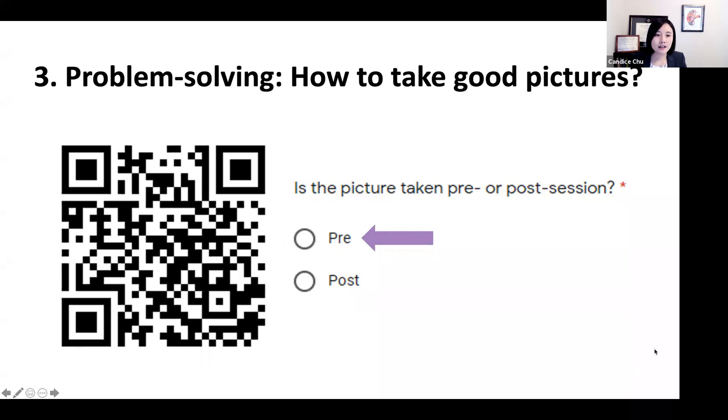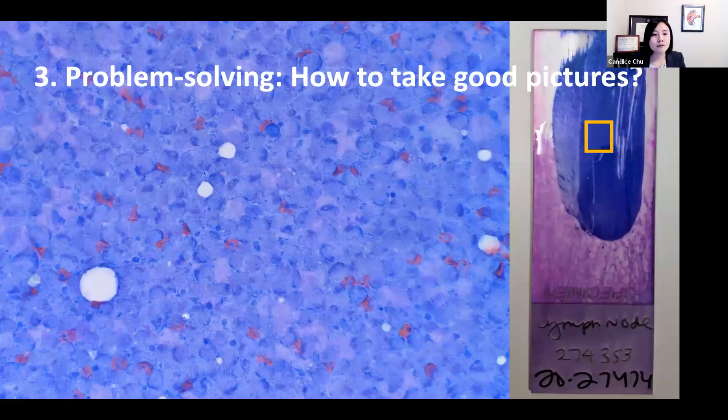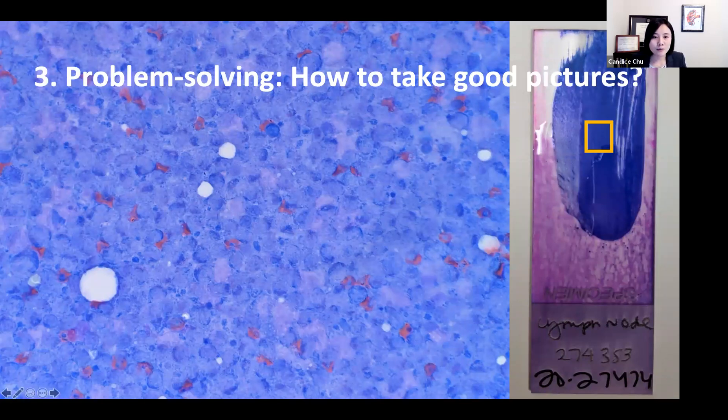So after they've done it, then I start to talk about my teaching content. I talk about first you need to find the optimal spot to take a picture. For example, this is a cytology smear.